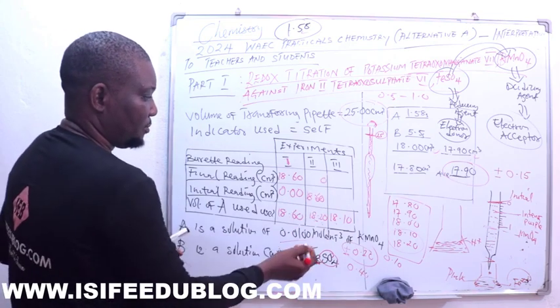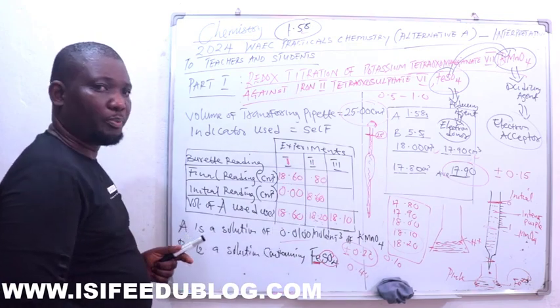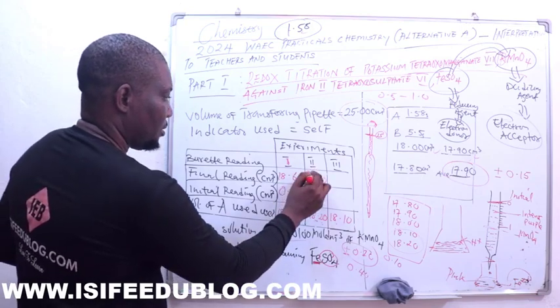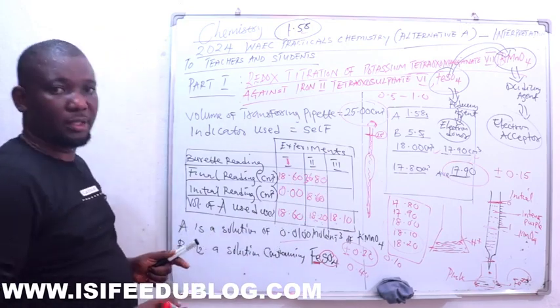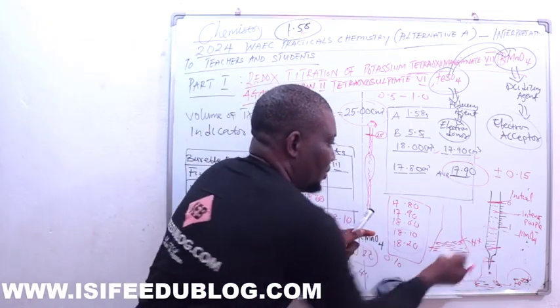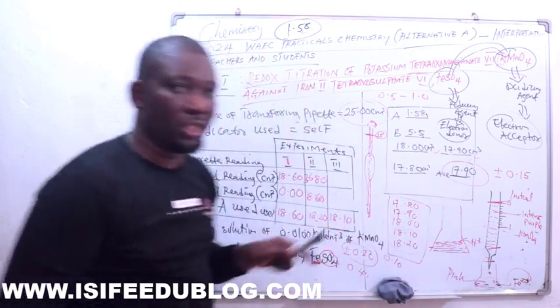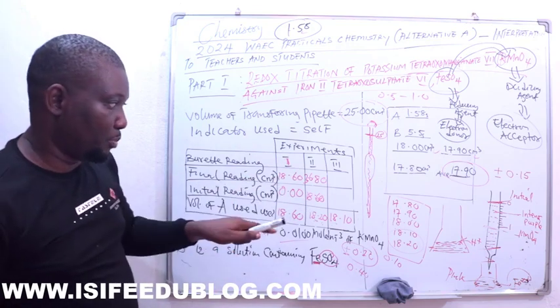What I need to do is to just add all this together: 0.8, this is 6, and this is 36.80. That means this should also go down here, very down. So let's add that this is where it is before the change in color. That's the end point of our second experiment.